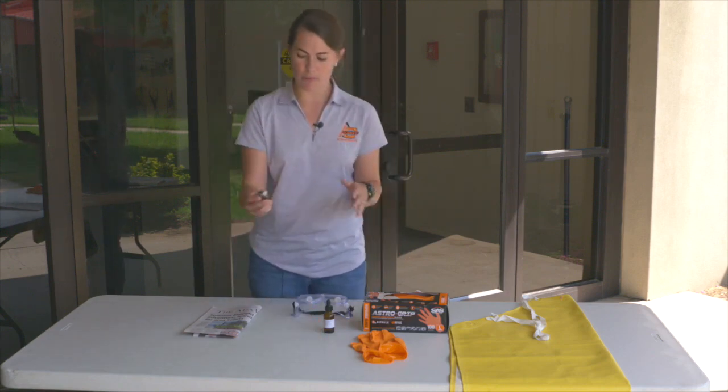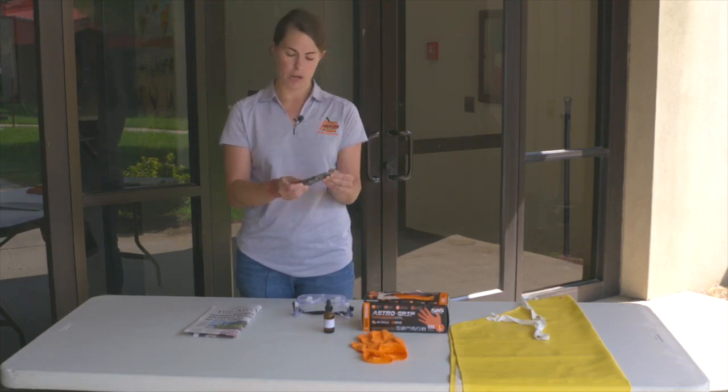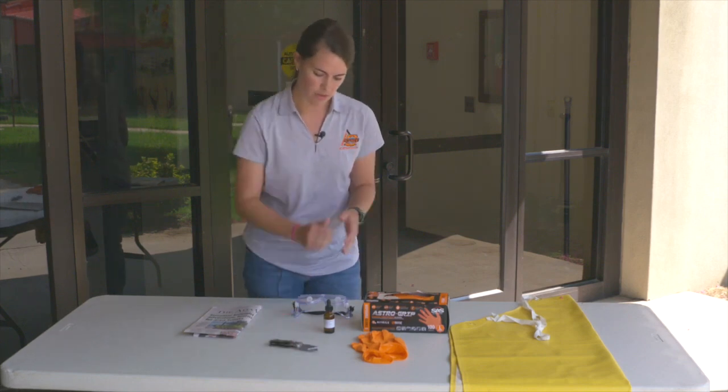The next tool — and it's very important — is a box cutter. You want a sharp blade that's ready to go, a box cutter to slice that stem in half. It should be very sharp, because things that aren't sharp are actually a little more dangerous and could cut you.